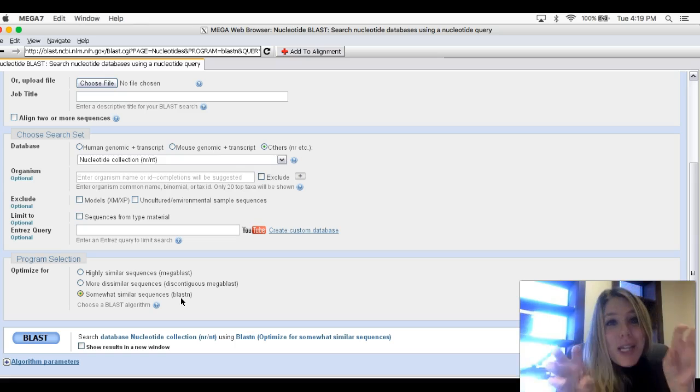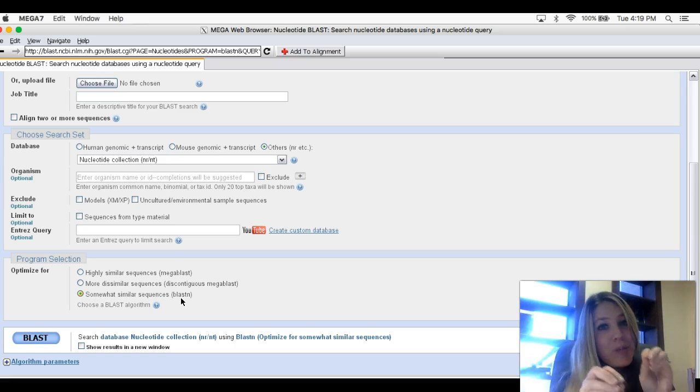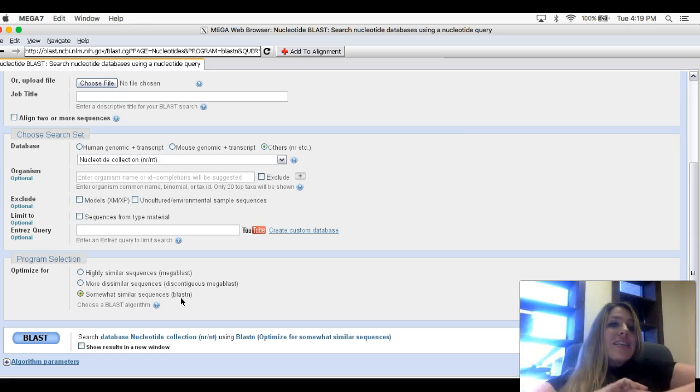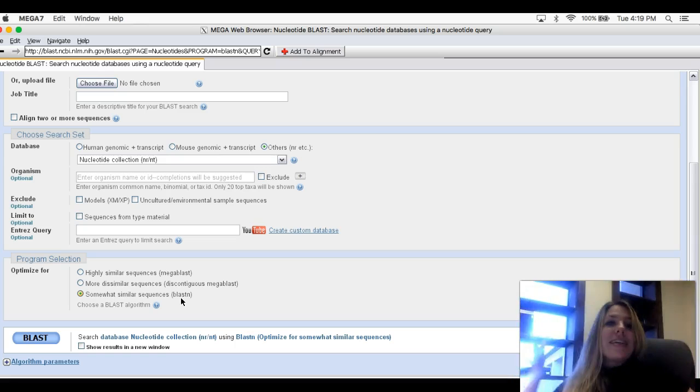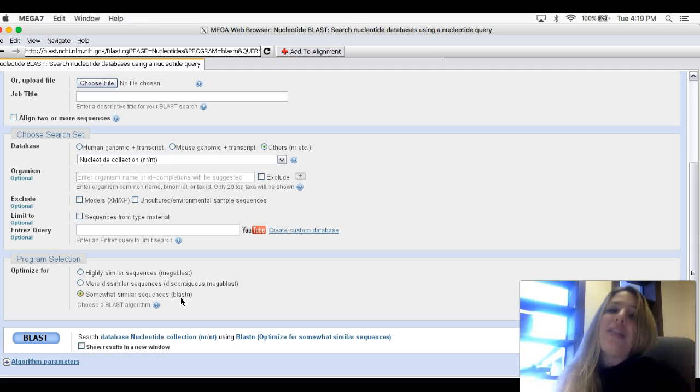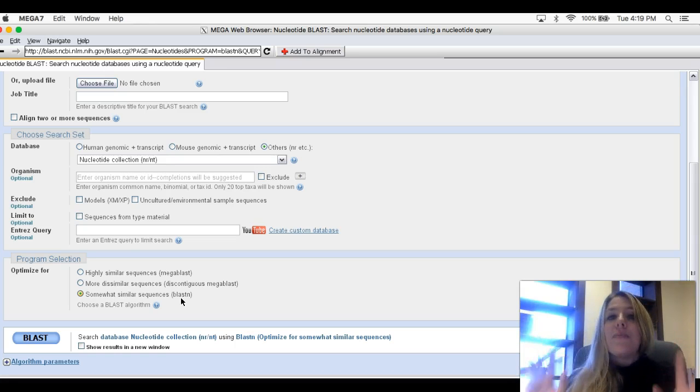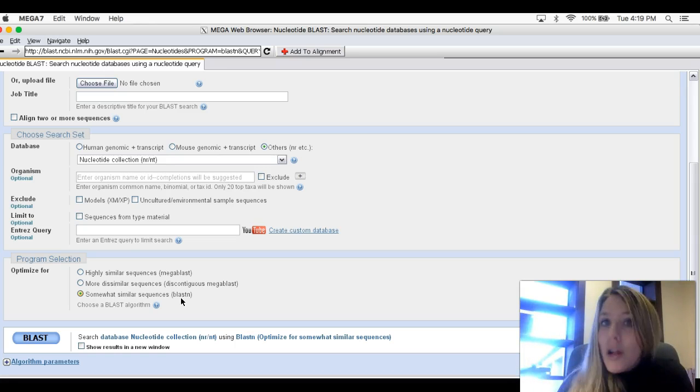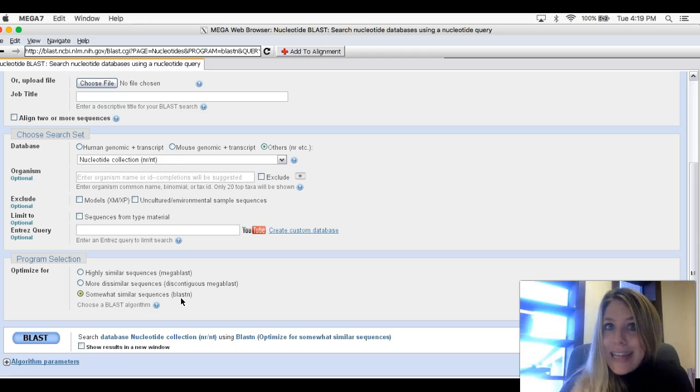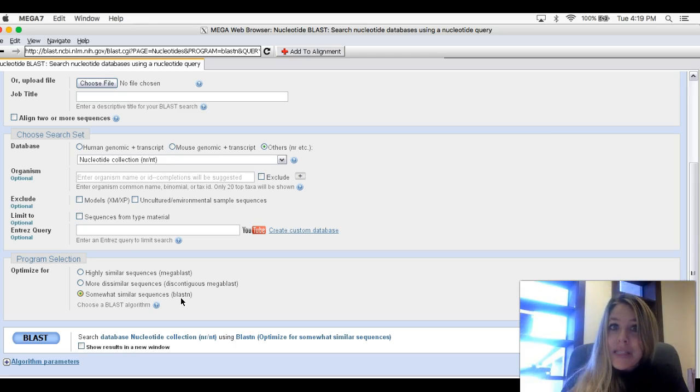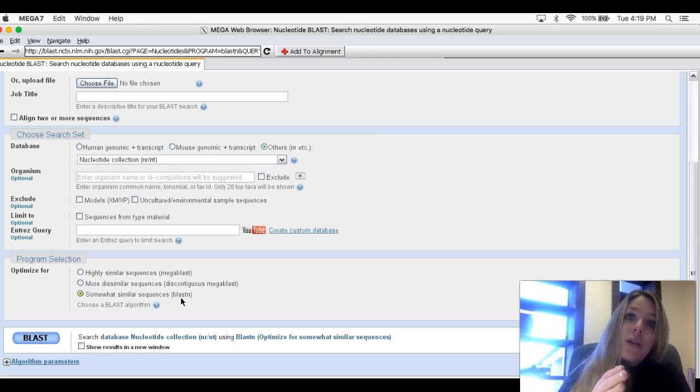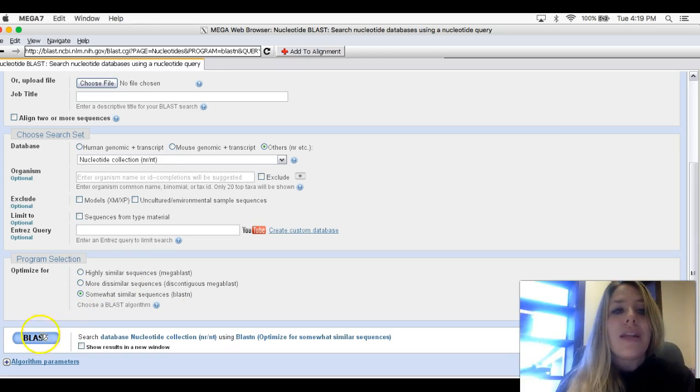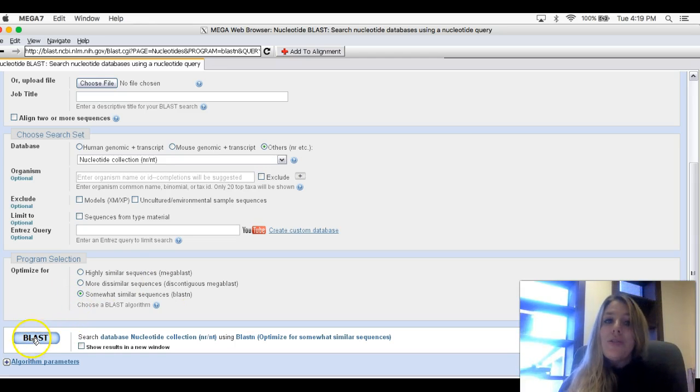What that means is we're going to take this sequence we copied in a human, and it's going to blast it against the entire database. It's going to compare it to all the other DNA sequences for all species in this database, so we can see how similar the gene in the human is to other species. Ready? One, two, three, blast.